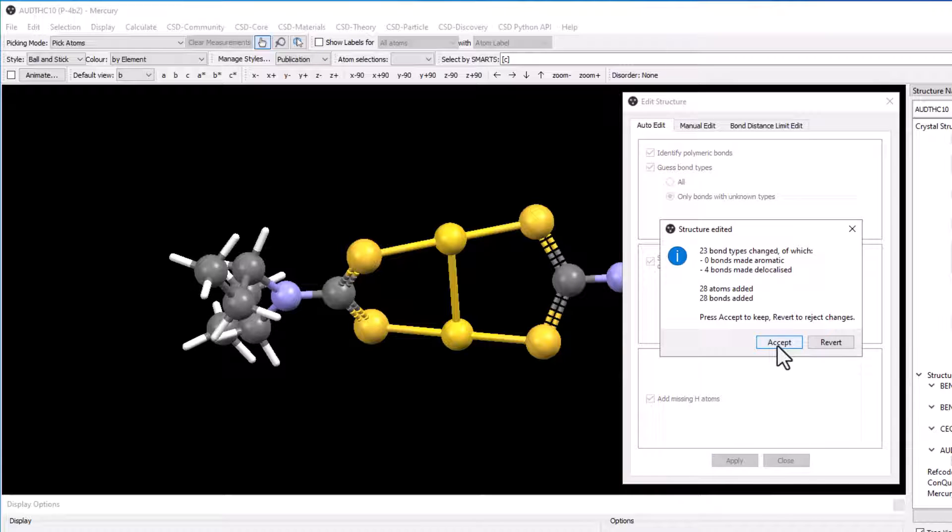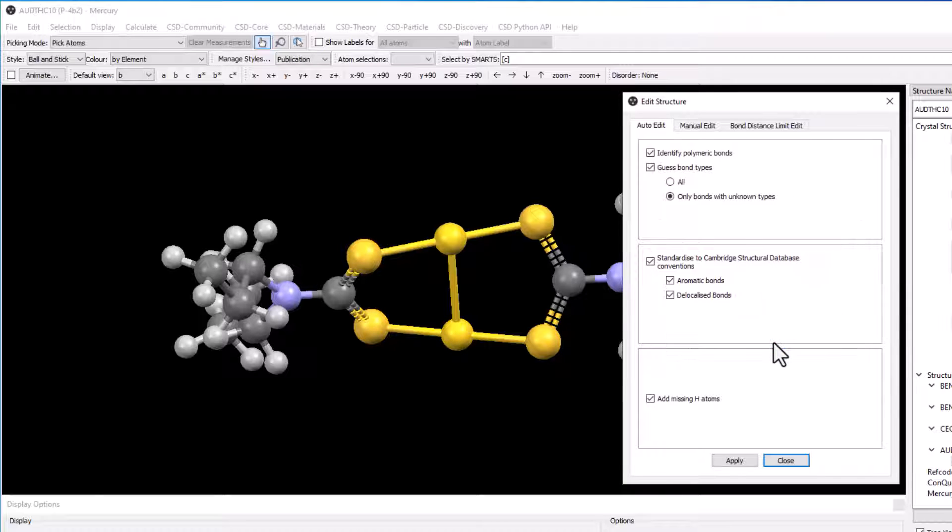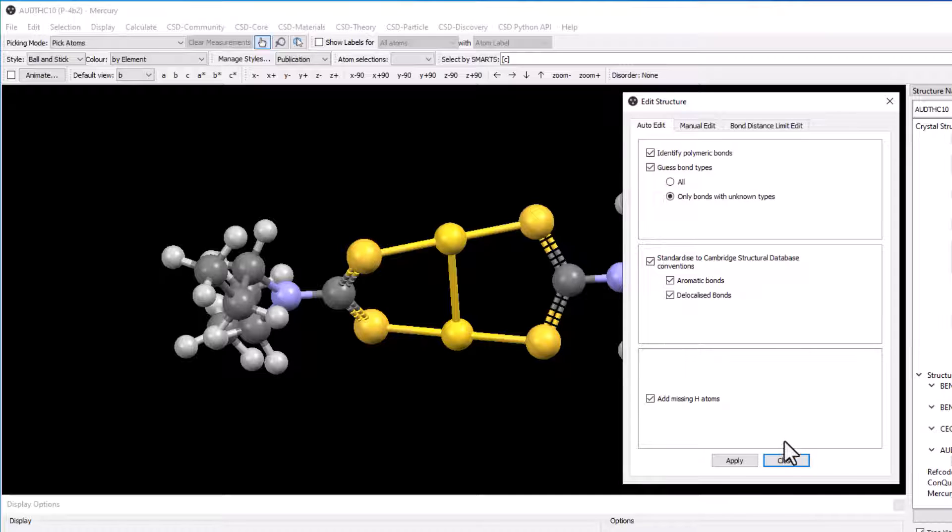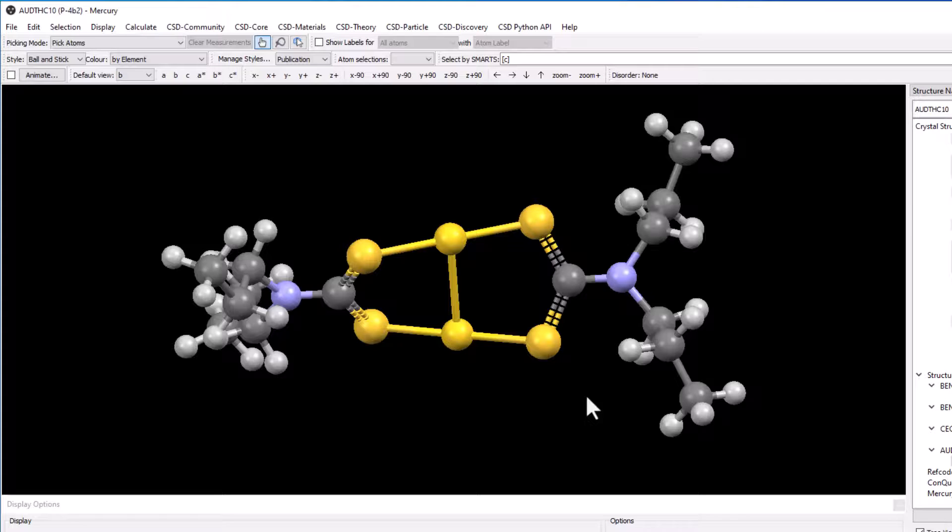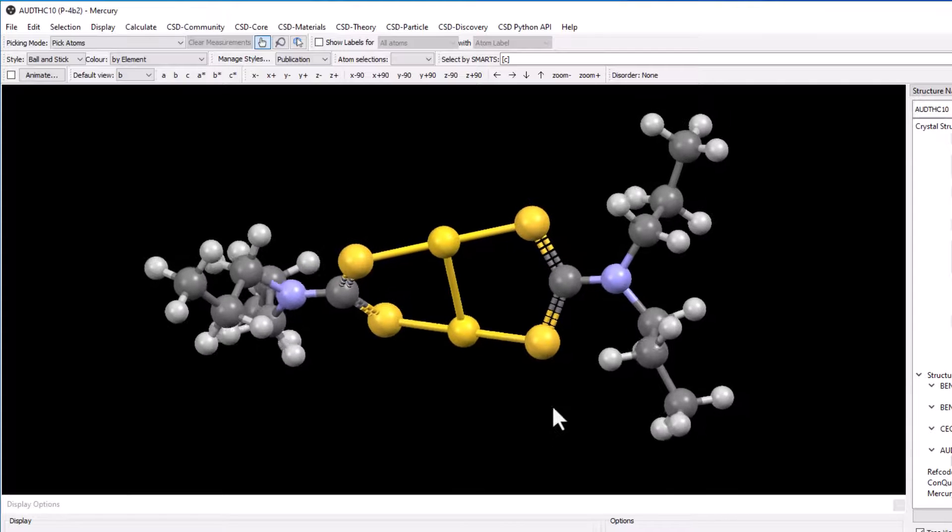A structure edited box will appear, reporting the changes that have been made. Click accept to allow the edits to be made. The hydrogen atoms are now displayed. Close the edit structure window.